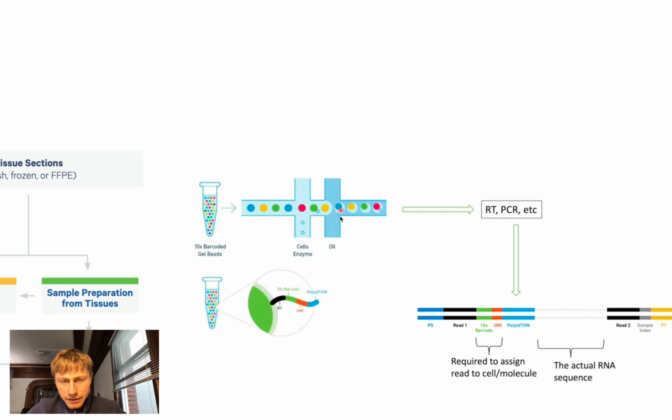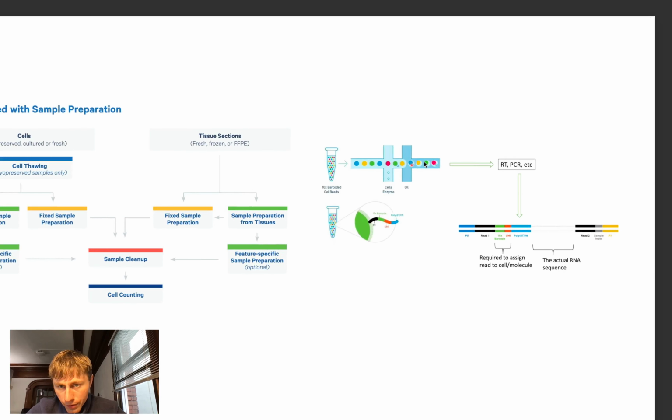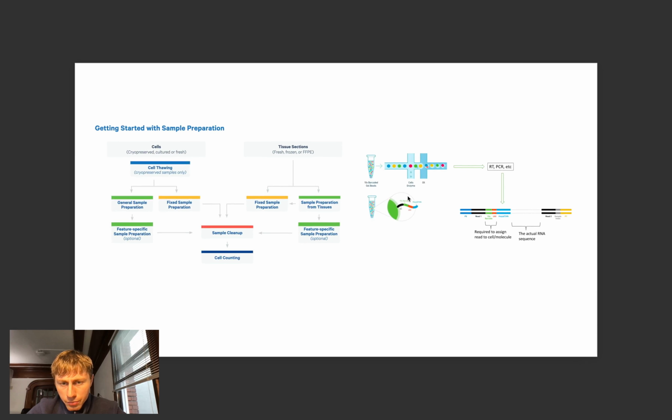So all of the cells in here will get lysed, and then the RNA will be released. This RNA attaches to this bead and is reverse transcribed to cDNA.